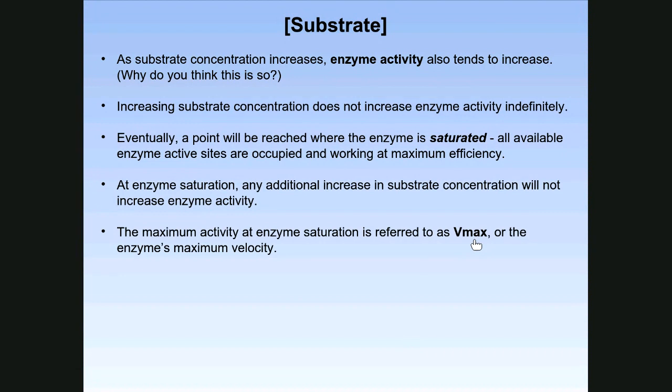So you're going to expose this enzyme to 6 different concentrations of its substrate. And then there are 2 other reactants that will automatically be present in the solution for the enzyme to act on the substrate and start producing product. In the very last pre-lab question, it's going to ask you to calculate data that you need to transfer to part 1 of the lab procedures.